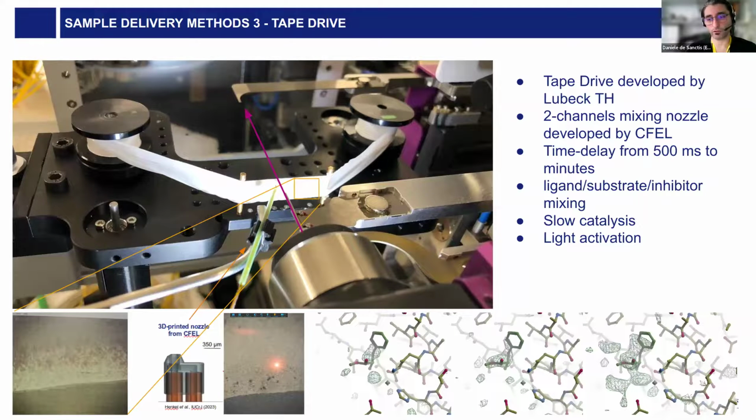One thing that we are also evaluating is the possibility to cheat with the turnover, in the sense that you can get the crystals in a pH region that reduces the efficiency, so that you can slow down the reaction and be able to observe it with more time points. But I think it is also very dependent on a case-to-case basis.